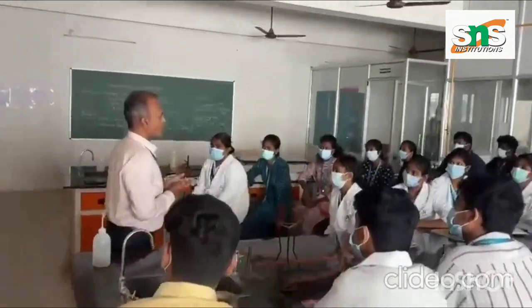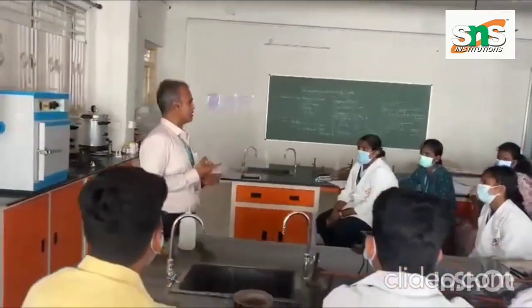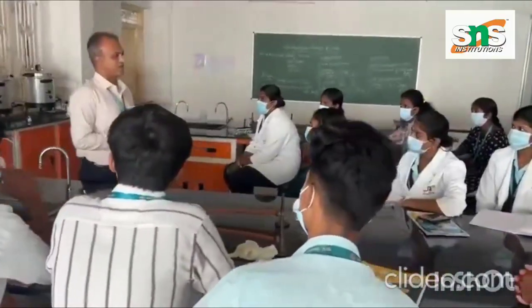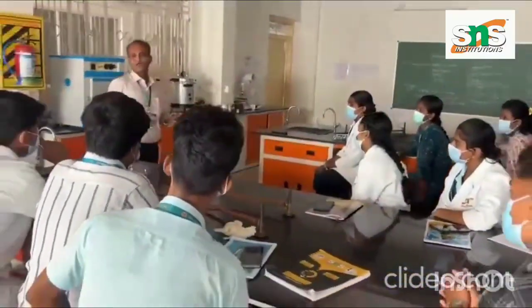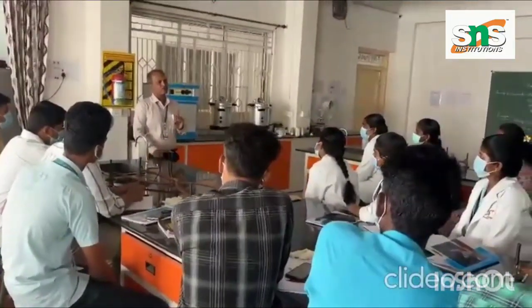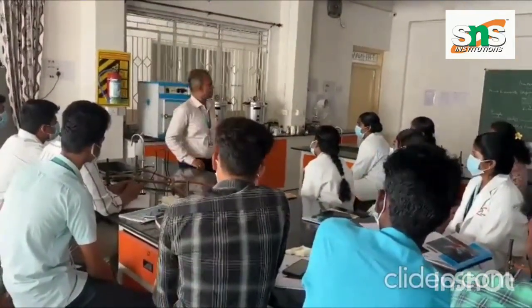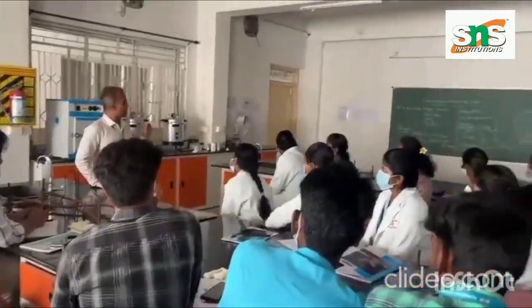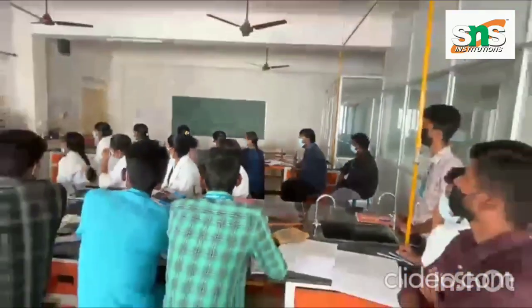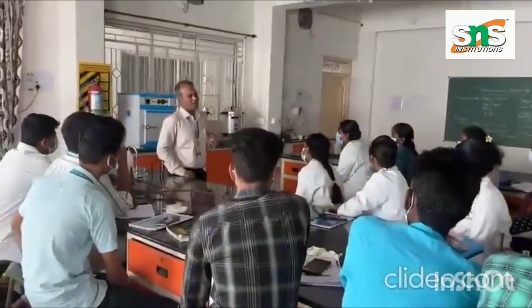It might be river water, well water, rainwater, or water supplied from the municipality. Whatever the water source, we need to ensure that the water we are consuming is free from pathogens. For that reason, in our lab we are going to check whether the water we are consuming is free from pathogens or not.